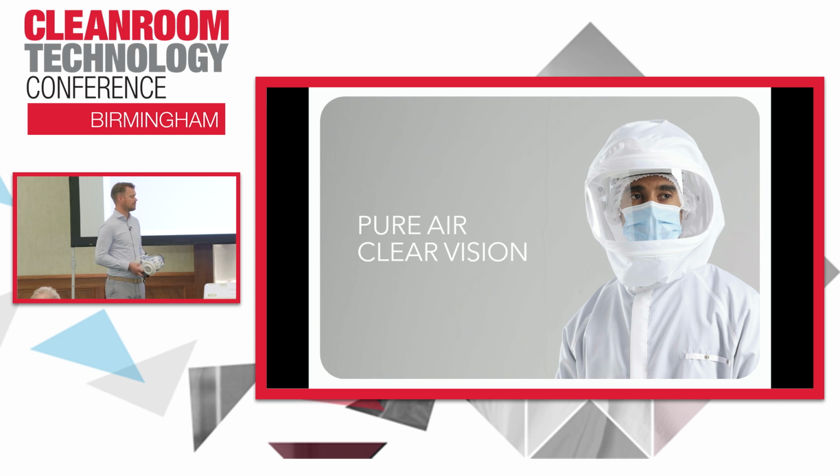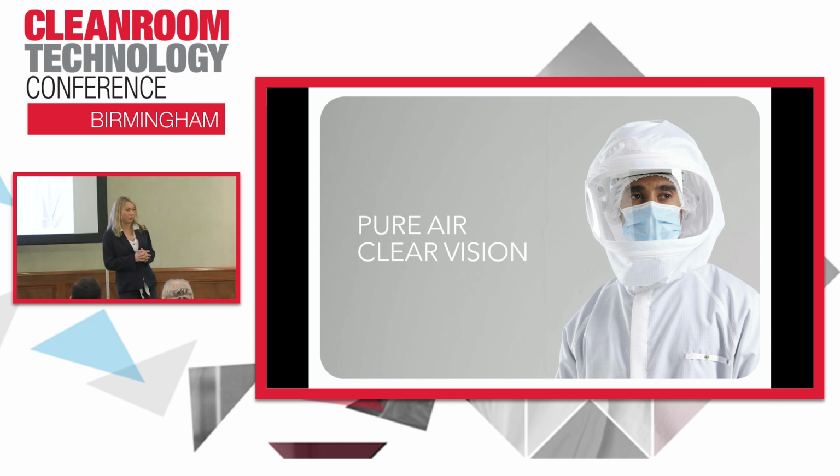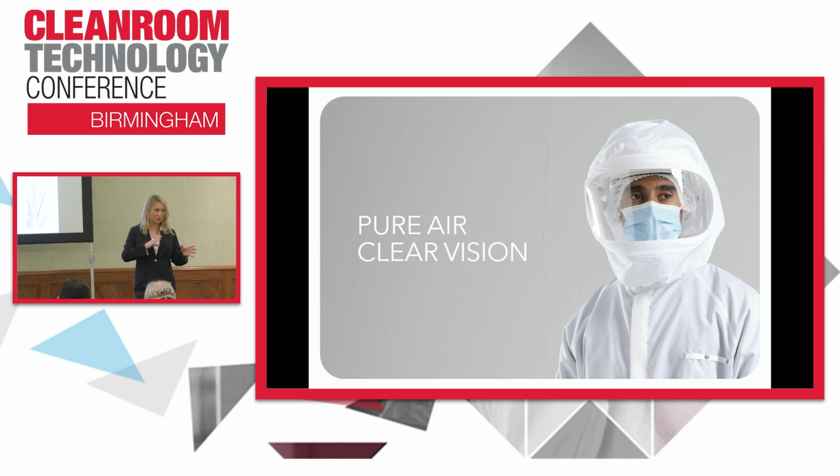If I may, we just formed a work group to see how different parts can be reused or recycled at the end of their lifetime, because our field of expertise is clear. It's the garments and all the accessories. We have a good solution for those, but this is a new and complex product. What we try to do is manufacture it from as few different materials as possible, so at the end of the lifetime it's easier to say, okay, this we put into this bin and then we recycle it. But we actually have a work group looking into each different part, which for us is not fully understood yet, how we will handle it at the end of its lifetime, because it is important that we have a plan for the end of life.